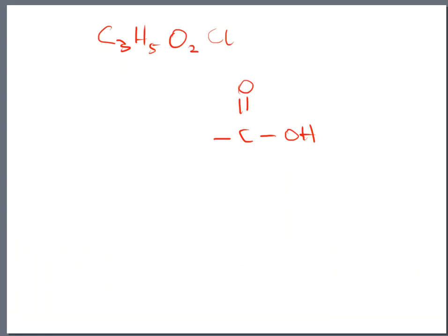I could give you 3 charts. Those 3 charts could be NMR, infrared, and mass spec, and I would not give you anything else. I could just say, go at it, folks. Here are your 3 spectra. You should be able to draw me a molecule based on that.